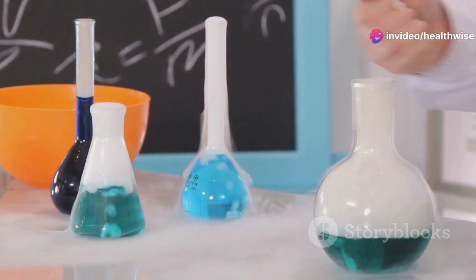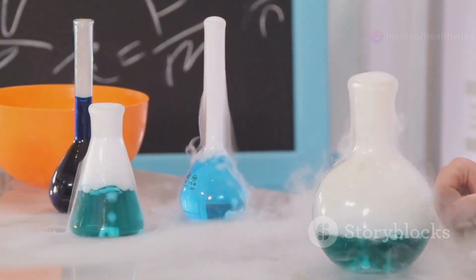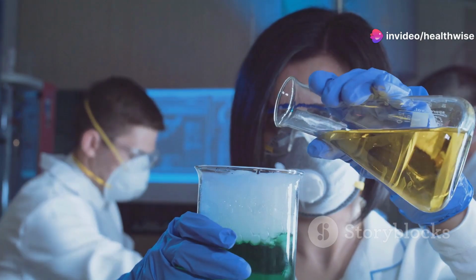Chromatography is a key technique used to separate pure substances from mixtures. It's essential in chemistry, biology, and even medicine. So, what exactly is chromatography? Imagine you have a mixture and you want to know what's inside. Chromatography helps by separating each component based on how they interact with two different phases.